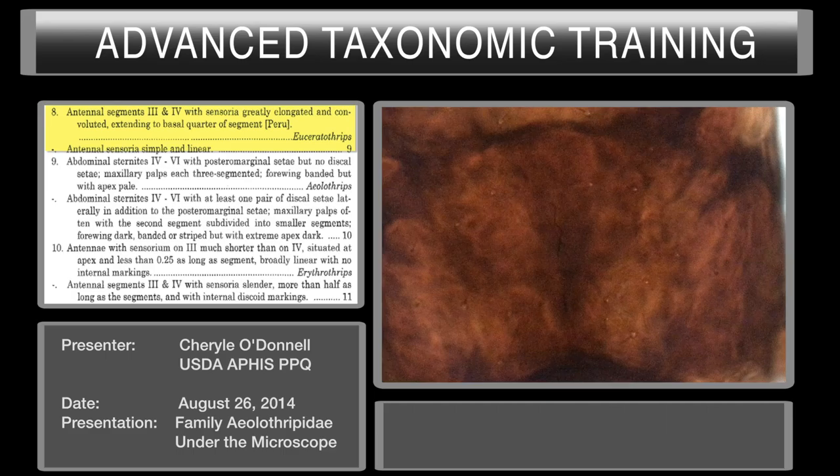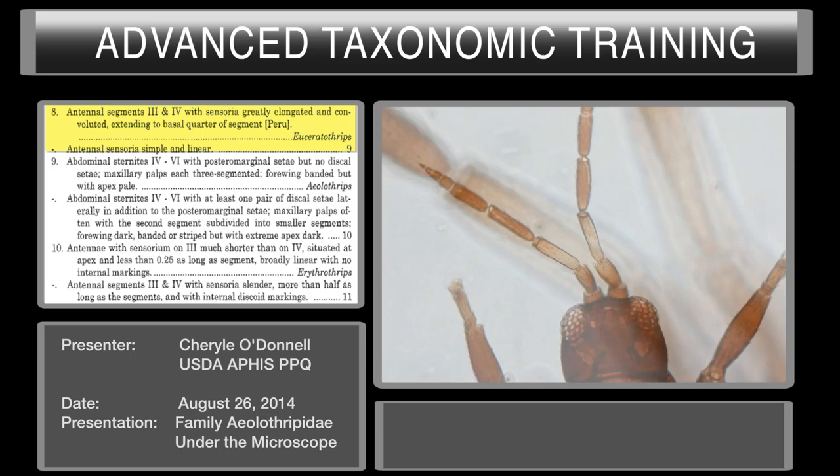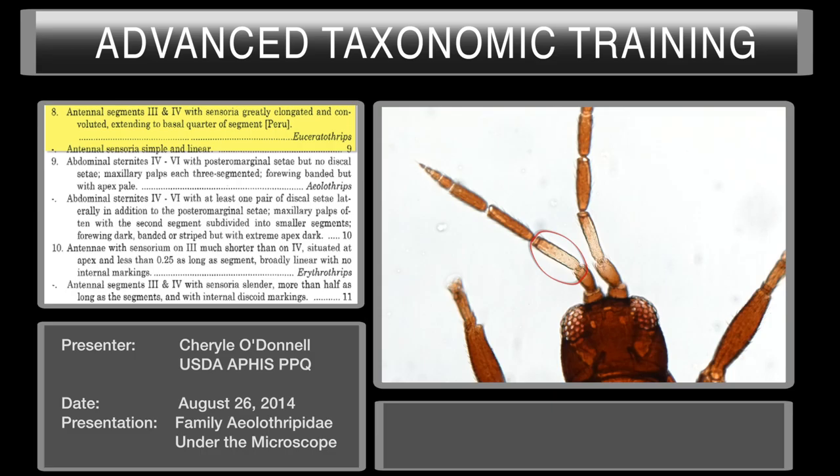That decision will take us to couplet number eight, where we evaluate the antennal sensoria on segments three and four again — whether they are greatly elongated or simple and linear. We don't have convoluted sensoria; they are very simple and linear. Simple and linear.